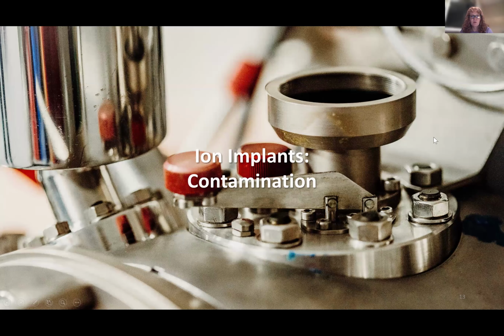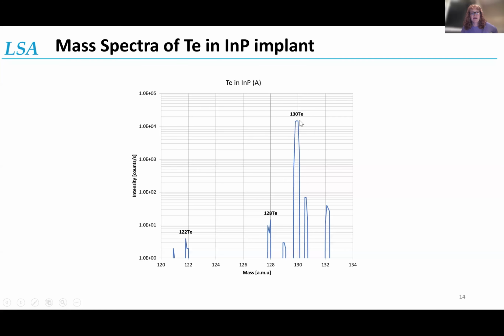Something to be aware of when you get ions implanted is possible contamination, whether that be from the implanter themselves not setting up the machine correctly, or possible external factors as well. So when we get a new ion implant, we ask for a specific mass unit to be implanted into the material. So in this case, we ask for 130 tellurium. And when we get it back, we run a mass spec. We make sure that we have only had 130 tellurium implanted.